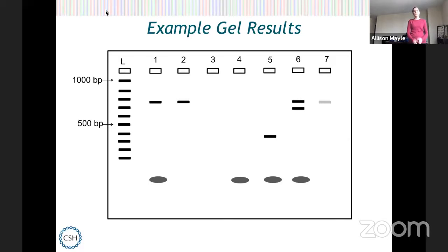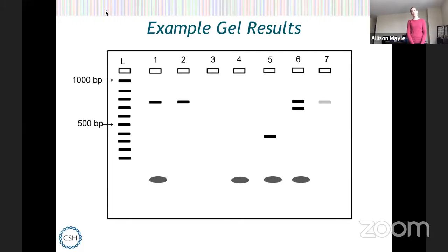Lane one looks great — this one I would send for sequencing. In lane two, we see the barcode we expect. We don't see the primers at the bottom, but I wouldn't be too worried if I saw this in one of my classes, because maybe the reaction just used up all the primers and there wasn't much primer left in the tube to visualize on the gel. Now, lanes three and four — take a look at those and think about what went wrong. These don't look like lanes one and two — we don't see that barcode band where we expect it at 750 base pairs.